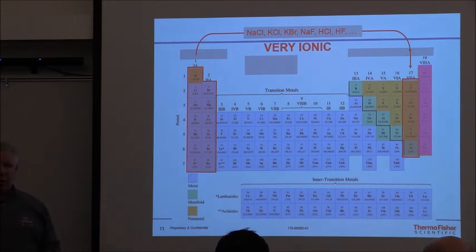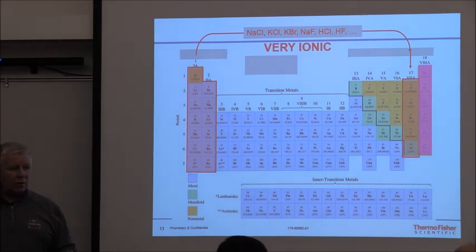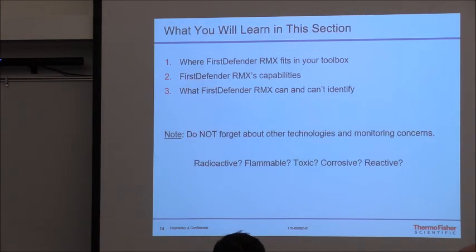And I know people don't want to hear that because they want the devices to go, hey, I want you to light up and show me everything. And I can bring you samples. And we could, and I could show you a dozen samples and say, oh, look, it gets a hit on the FD and it gets a hit on the Raman. But I'm going to give you a couple samples of one sees and one doesn't and so forth so that we understand that aspect of it. Okay? That's it. That's kind of the basic chemistry. Gee, that wasn't too rough, was it? Okay?